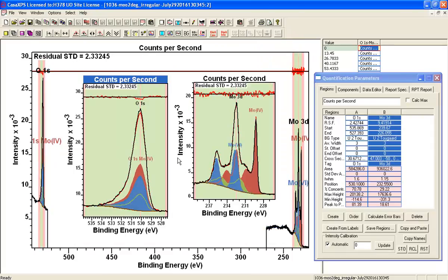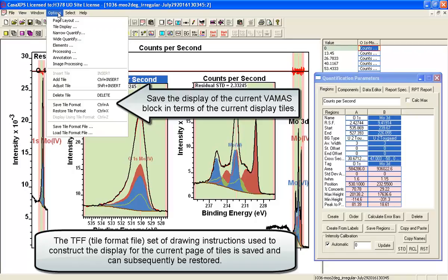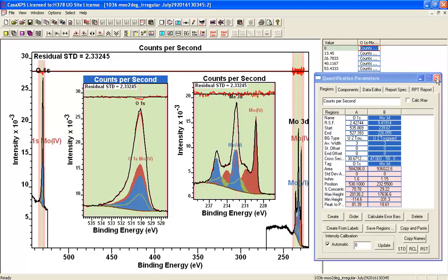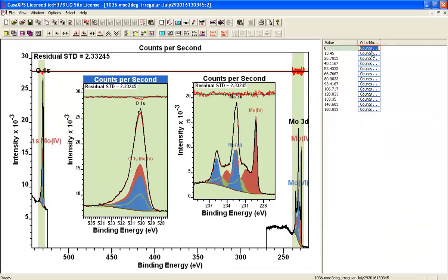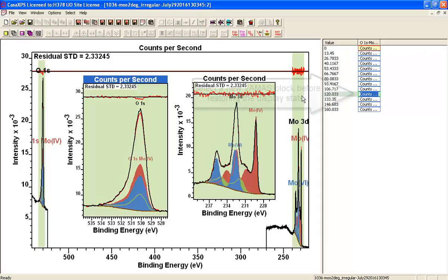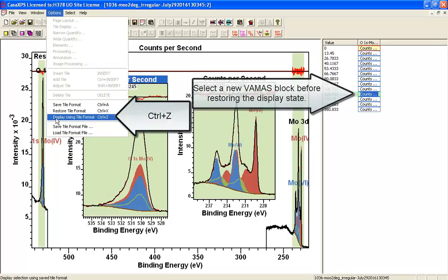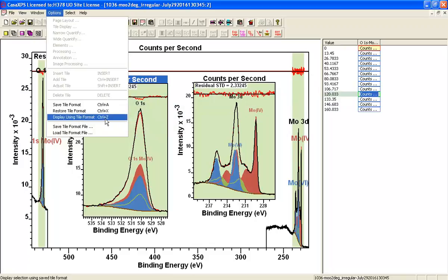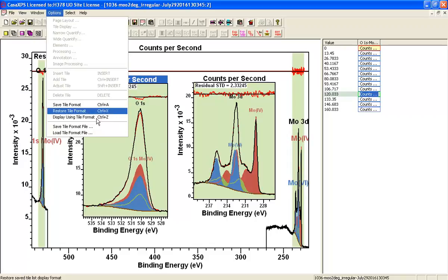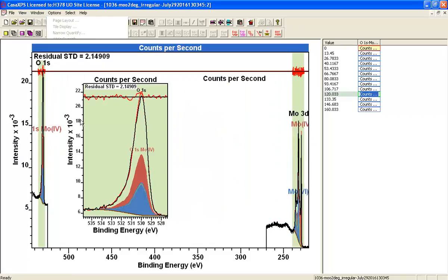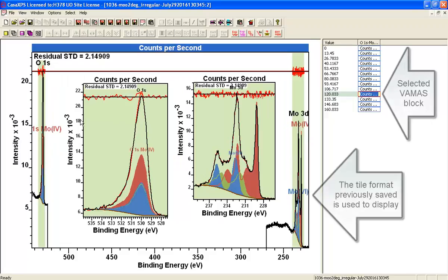Now I've got different fonts for the insert tiles. On the options menu there's an option that says 'save tile format,' and what that has done is save this format that was prepared based on this first VAMAS block. Actually, these are all very similar arrangements of data and I'd quite like to see them in the same way. So by saving that tile format, I can say 'display using tile format,' which will take the selected VAMAS block and use this display — and hence the data can be displayed using exactly the format I've just set up.